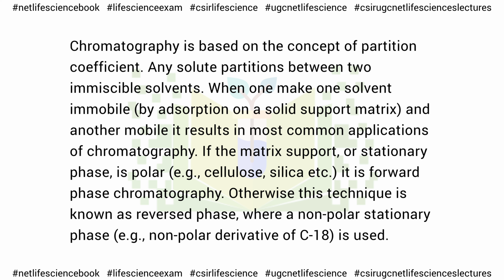Chromatography is based on the concept of partition coefficient. Any solute partitions between two immiscible solvents. When one solvent is immobile and another mobile, it results in most common applications of chromatography. If the matrix support, or stationary phase, is polar, it is forward phase chromatography. Otherwise, this technique is known as reversed phase, where a nonpolar stationary phase is used.